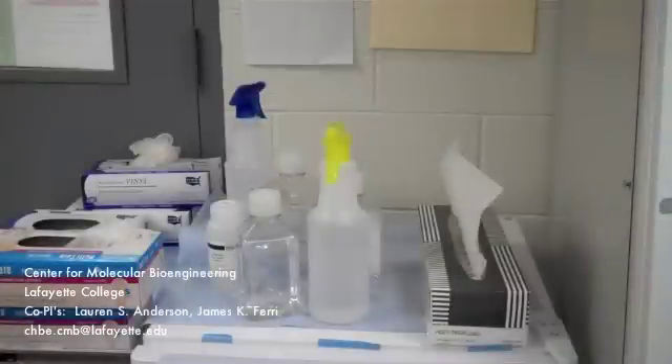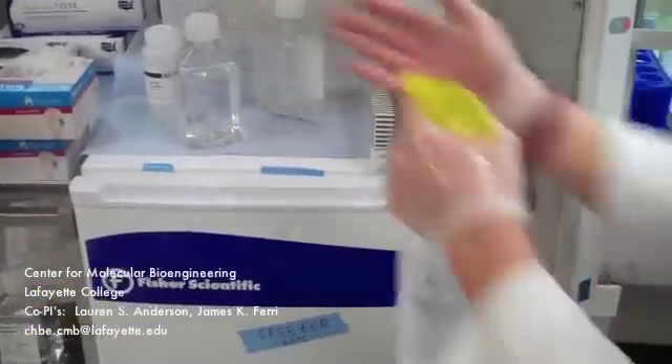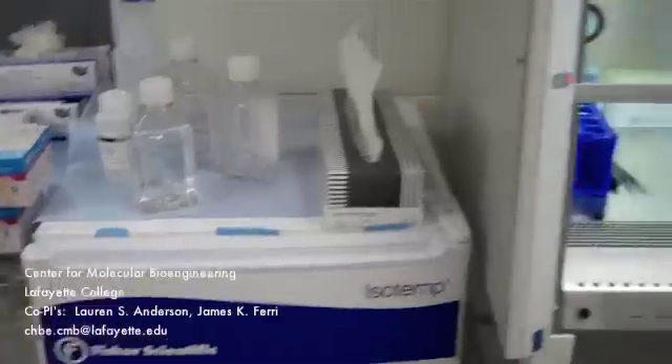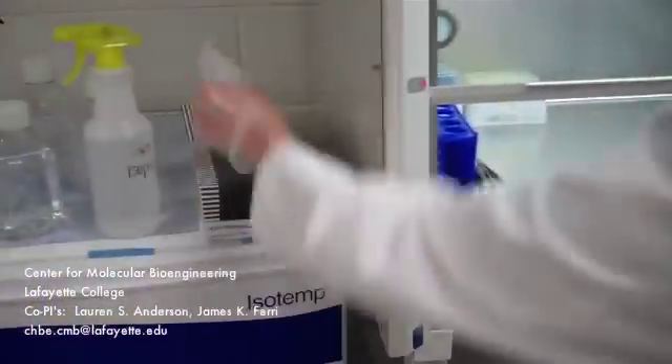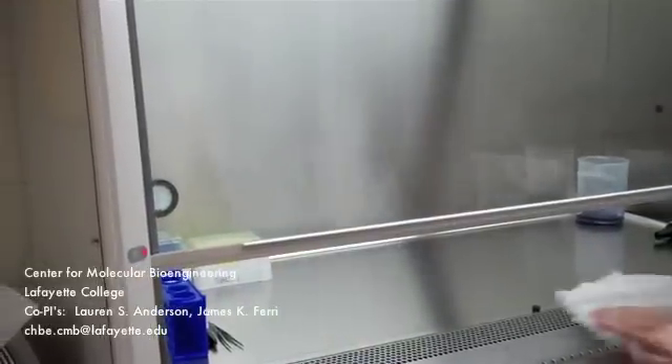The biosafety cabinet is an area where you perform sterile cell work, therefore it is necessary to maintain proper sterile technique. Spray 70% isopropyl alcohol on your gloves and rub them together until dry. Spray the outside window of the glass and armrest and wipe down the glass and armrest with a kim wipe. Then throw the kim wipe away.